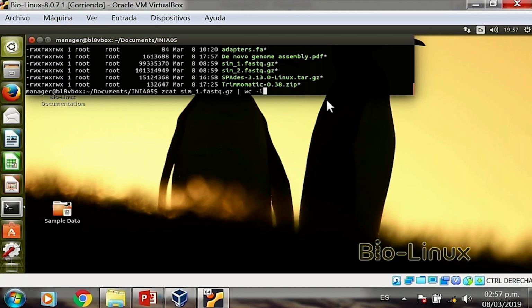So now that you've already seen what a FASTQ file looks like, how to open it, how to explore it a little bit, there are many more ways to explore it, but you've done the first quick, easy part. Now we can start the theoretical/practical session, genome assembly.